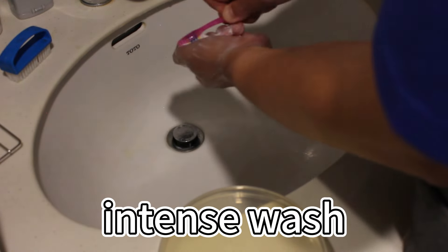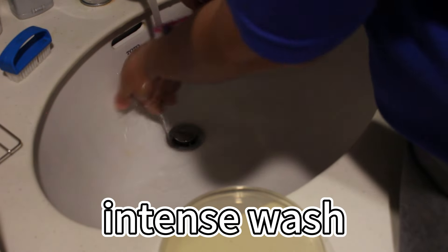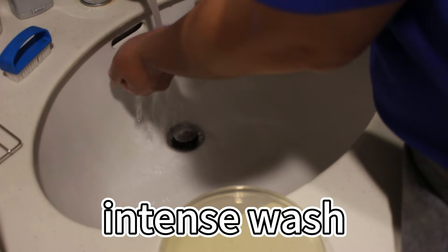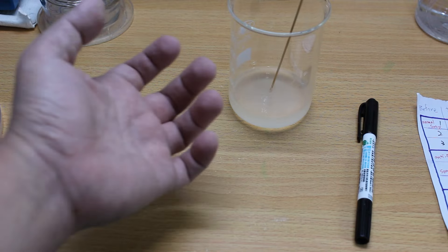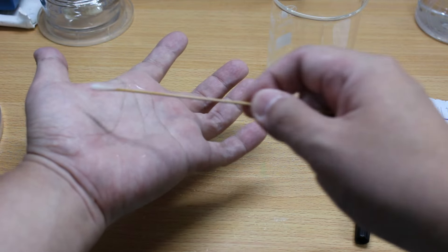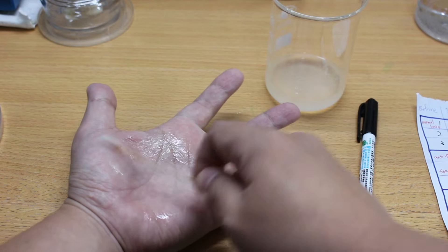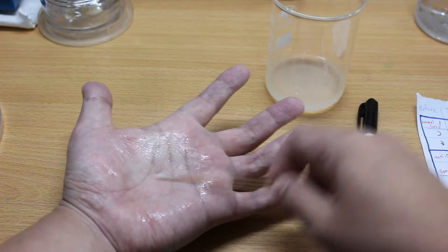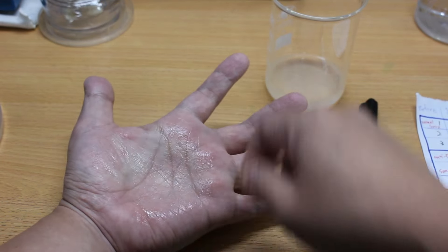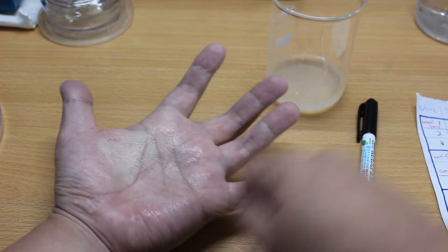So after I put bacteria on my hand, I will first use water to rinse my hand, make sure the bacteria will not just get washed off by simply water coming through. And then I will use different wash methods combined with normal and antibacterial soap to wash my hand. And after that I will stick my hand on the agar plate to see if I actually get my hand clean. And also there will be one group which I will only wash with water without any soap.